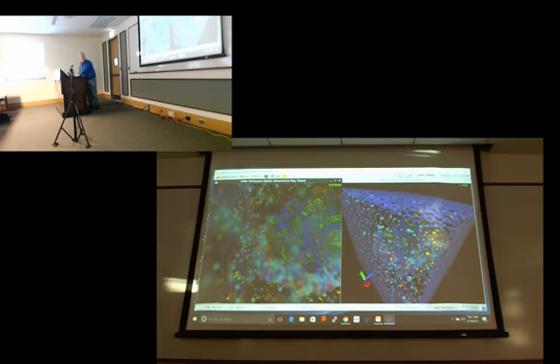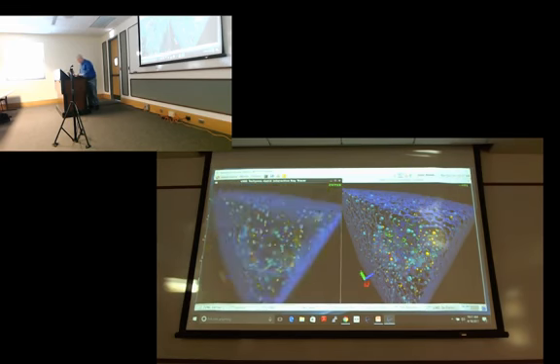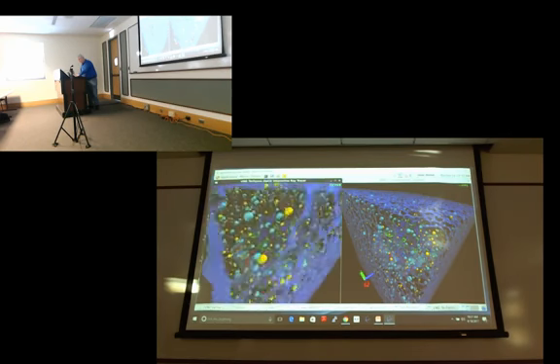So I've gone very far with this. Normally you wouldn't do anything that crazy, but I just wanted to give you an idea of the range of things you can do. And of course, you can turn these things all on and off while you're flying the camera around.